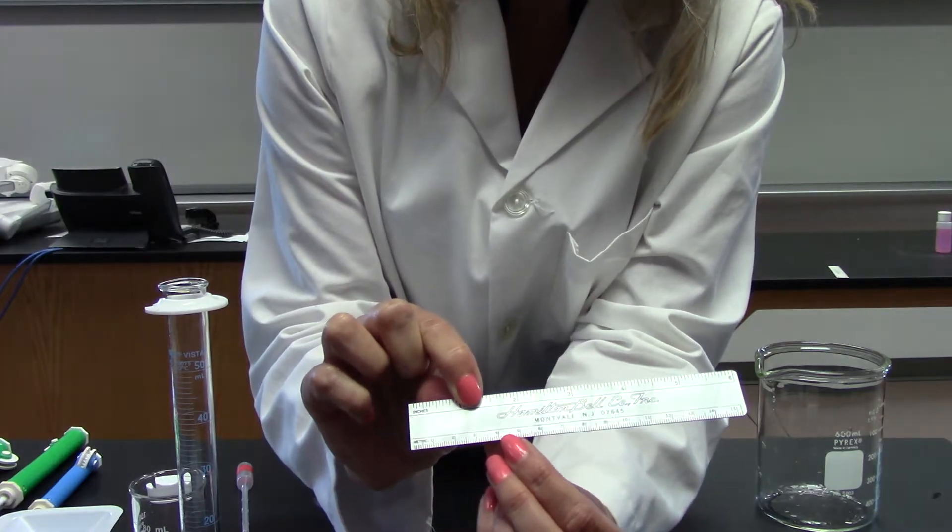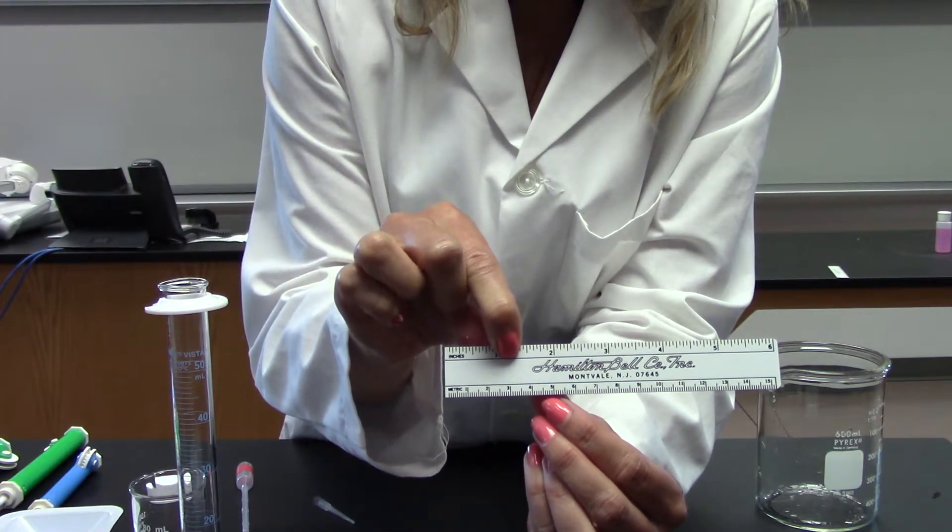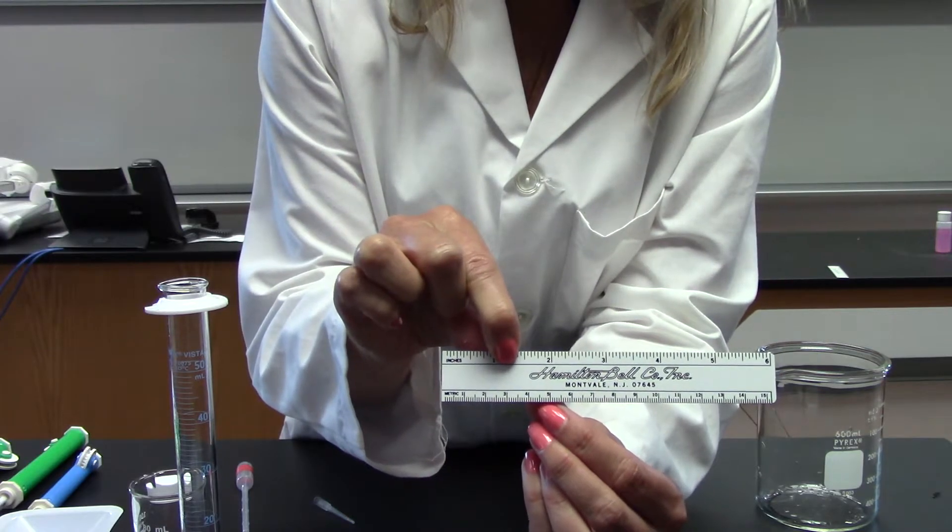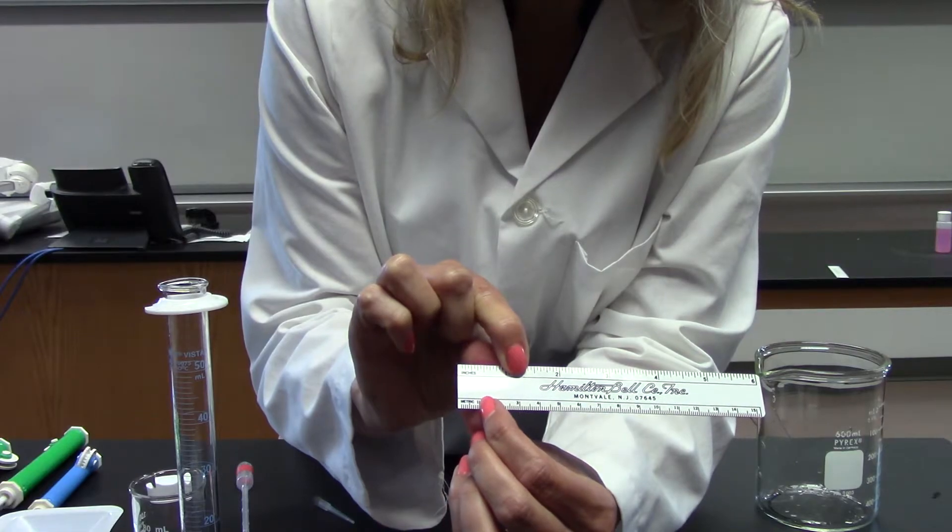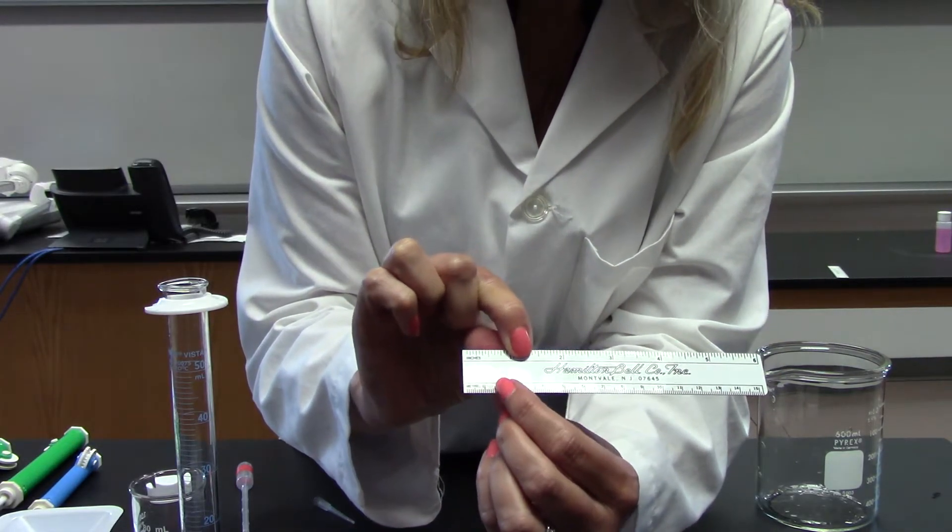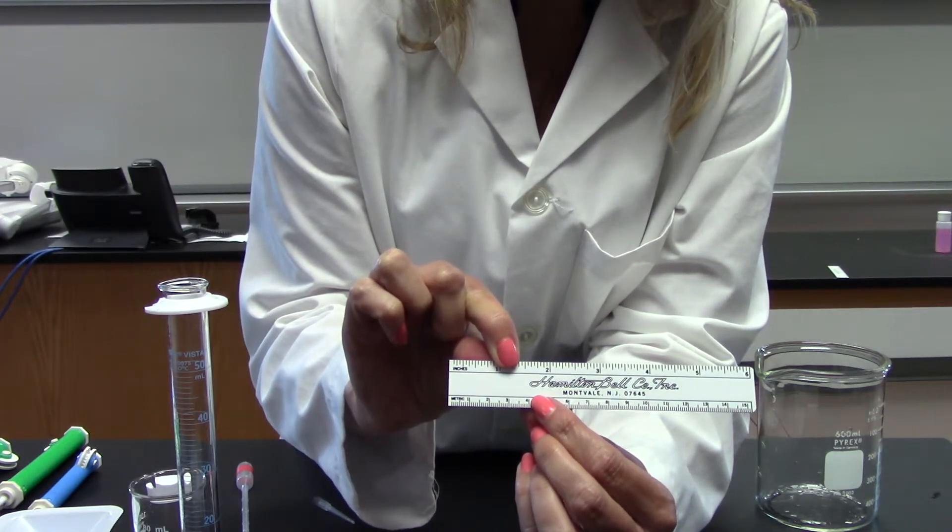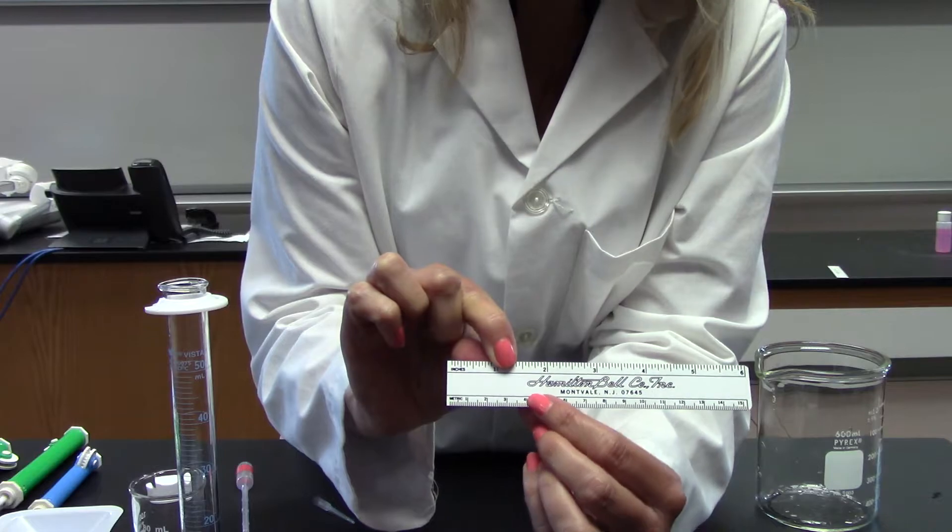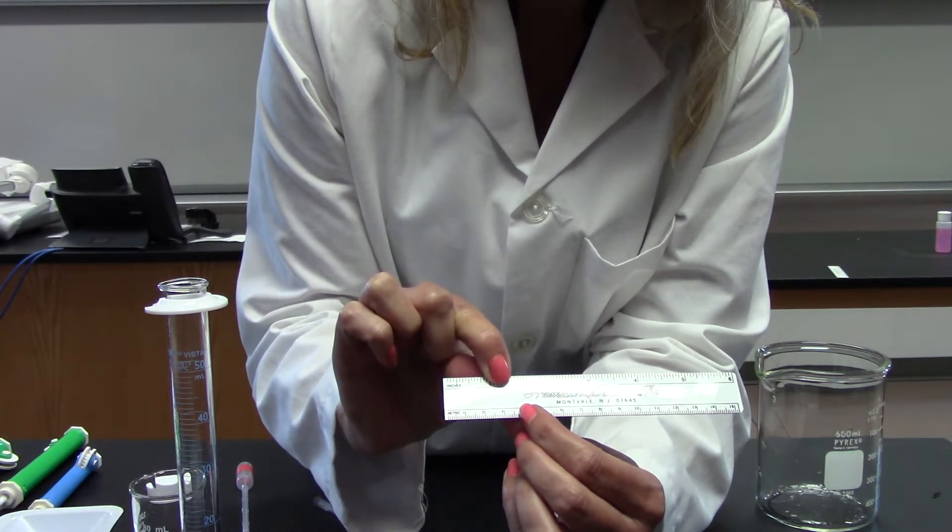You'll notice one, two, three, four, five, and so on - those are centimeters. Each of the lines is a millimeter. There are 10 millimeters per centimeter. So if I went to four centimeters, that would be 40 millimeters. You will be measuring lots of things in millimeters - it's important to realize it's the little lines.